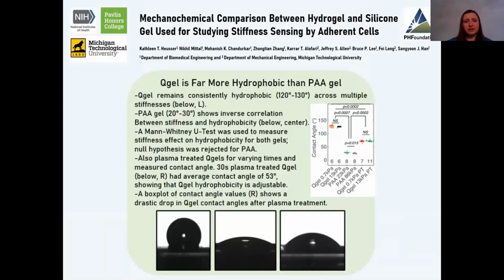Our first finding with contact angle measurement was that Qgel is far more hydrophobic than polyacrylamide gel. Consistently, Qgel had a contact angle of 120 to 130 degrees across multiple stiffnesses, as you can see in the left figure below. Polyacrylamide gel showed a far more hydrophilic characteristic with a contact angle of 20 to 30 degrees, and this changed based on stiffness.